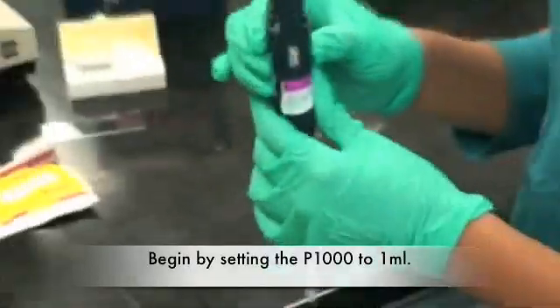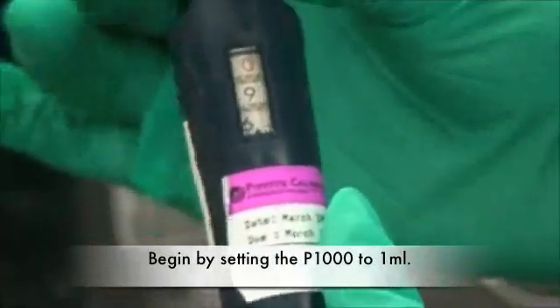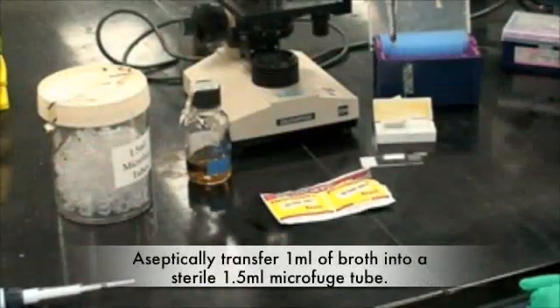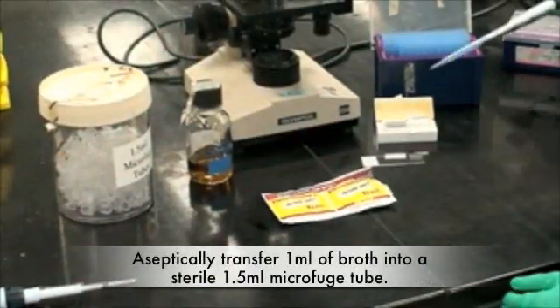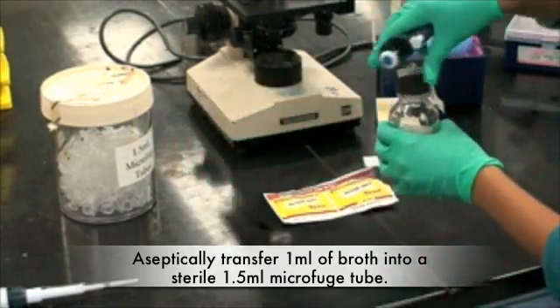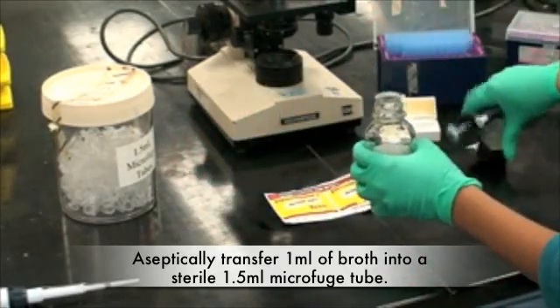Begin by setting the P1000 to 1 milliliter. Aseptically transfer 1 milliliter of broth into a sterile 1.5 milliliter microfuge tube.